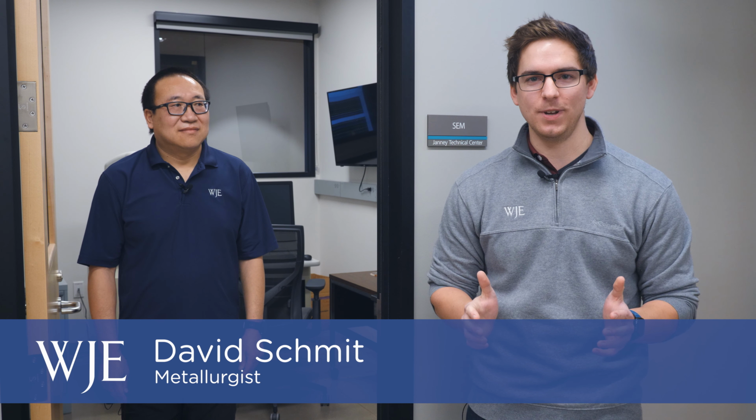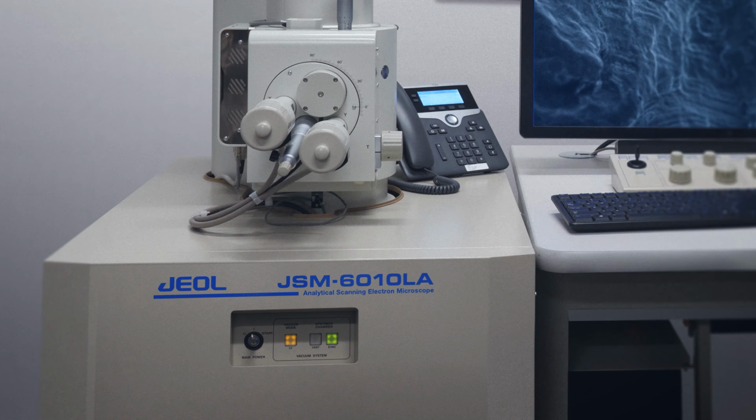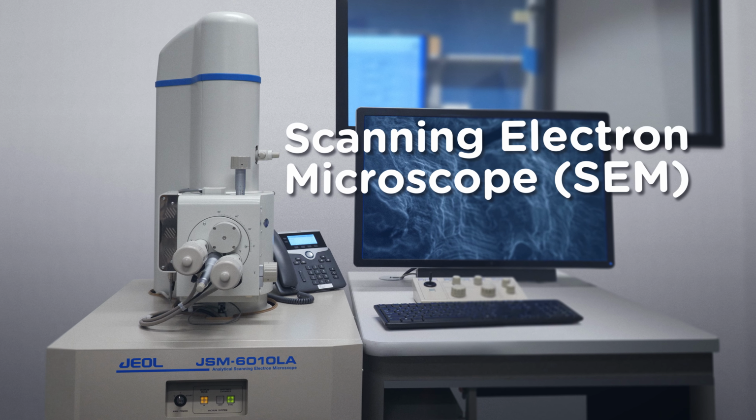Hi, I'm David Schmit. I'm a metallurgist here in the Metallurgy and Applied Mechanics unit here in WJE's Janney Technical Center. Hi, I'm Hugh Hou, a petrographer at the Janney Technical Center. Today, Hugh and I are going to briefly discuss our scanning electron microscope, also called an SEM.